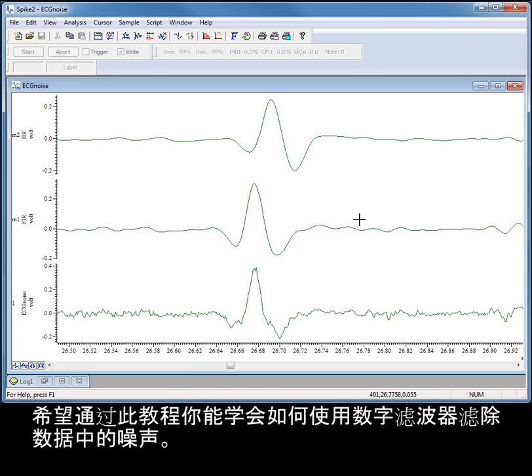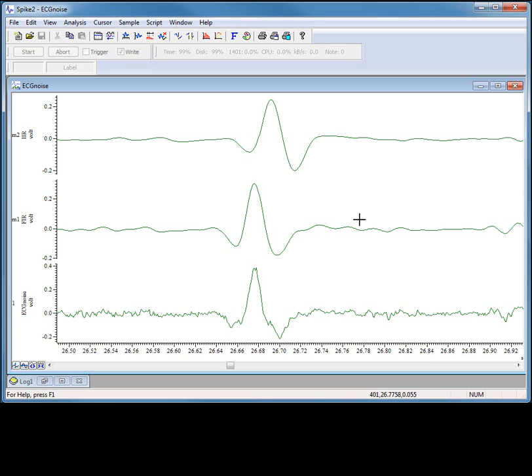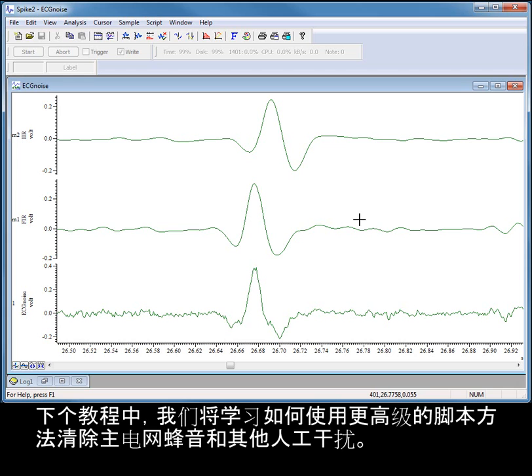I hope this video has given you an insight into how to use digital filters to remove noise from your data. In our next tutorial, we'll be looking at how to remove mains hum and other artifacts using more advanced scripting methods.